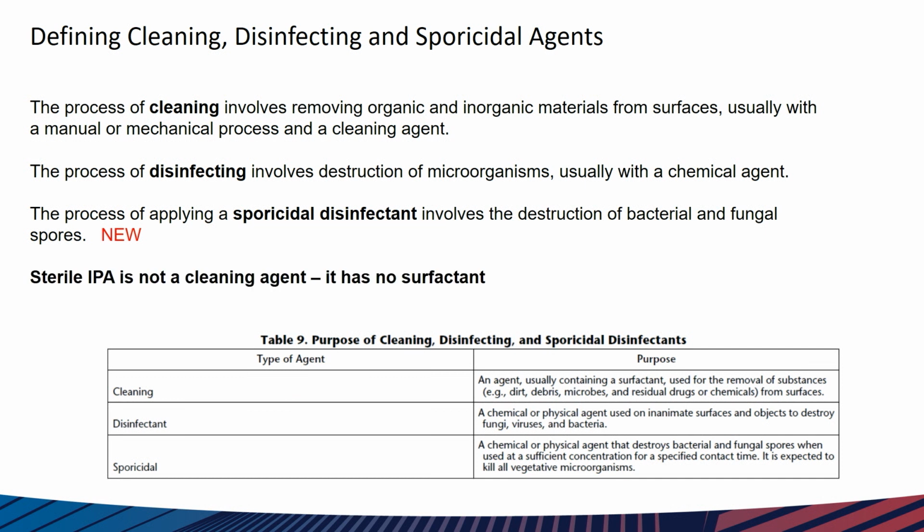I always like to just throw in this note, sterile IPA is not a cleaning agent. There are no surfactants in sterile alcohol. So we do have folks that think they are cleaning and disinfecting. There are a few, as Mark pointed out, disinfectants that have registration, so they are registered disinfectants, but they've got 5, sometimes 10-minute dwell times. Very difficult to achieve in a clean room environment. We're constantly having so much air movement. So just remember that sterile IPA is not a cleaning agent. There's no surfactant in that.